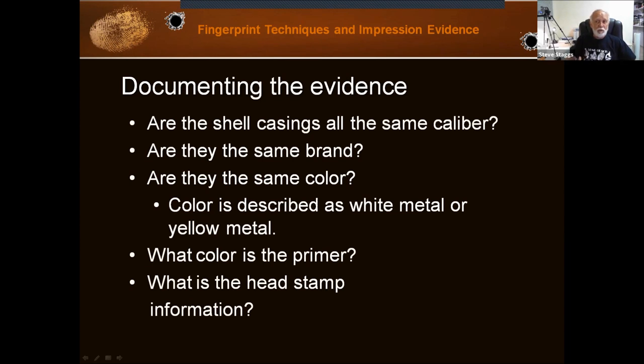First of all, we need to do some documentation. Are these casings all the same caliber? Are they the same brand? You can see the stamp on the base of the cartridge case. Are they the same color? When you describe the color in your notes and report, it's either white metal or yellow metal — you don't actually say brass. You say yellow metal because you don't really know if it's brass or just a yellow metal. What color is the primer? The primer often is a different color than the case. And what's the head stamp information?